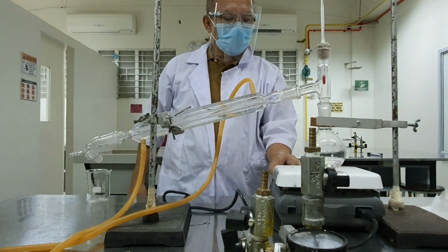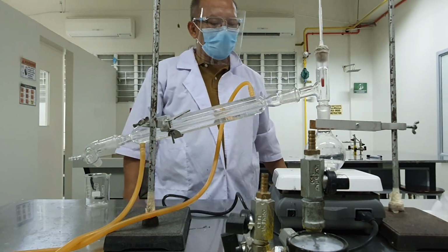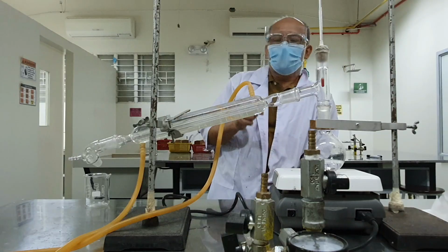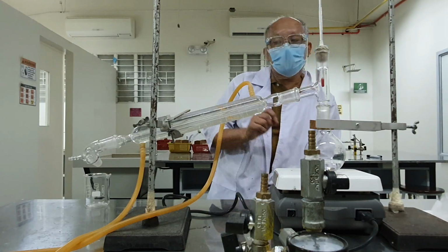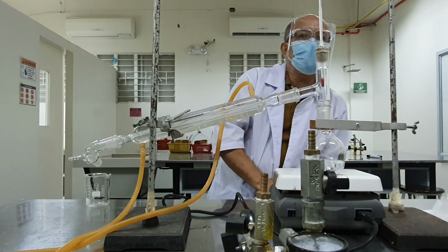So we're going to start. We just have to wait for the mixture to boil. And what we're going to do is record the temperature every 20 drops. Okay? So every 1 ml.